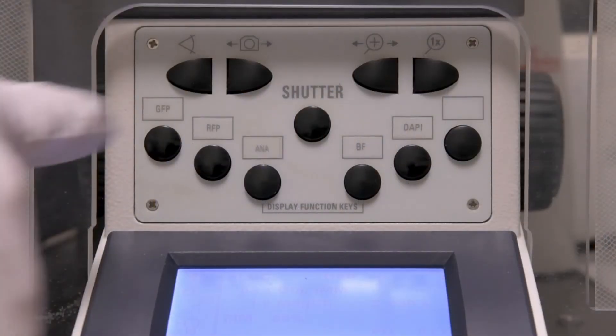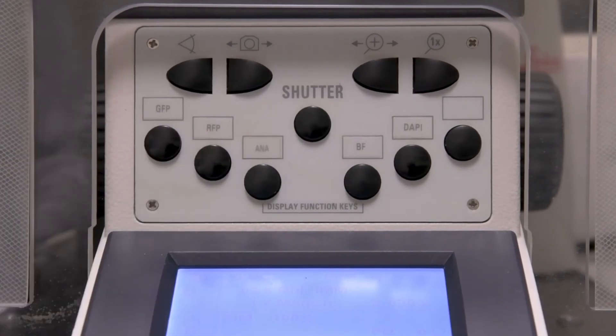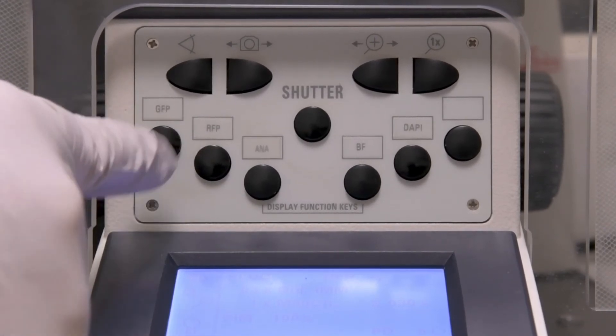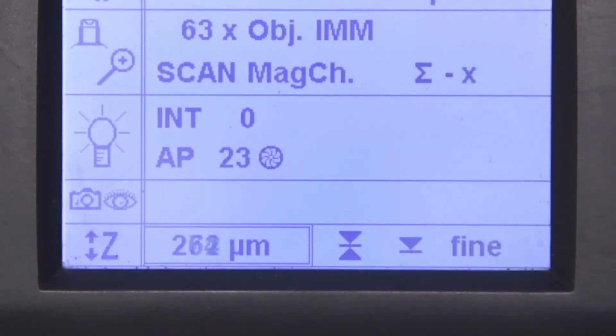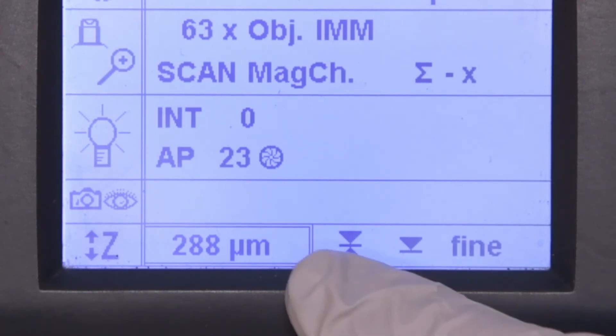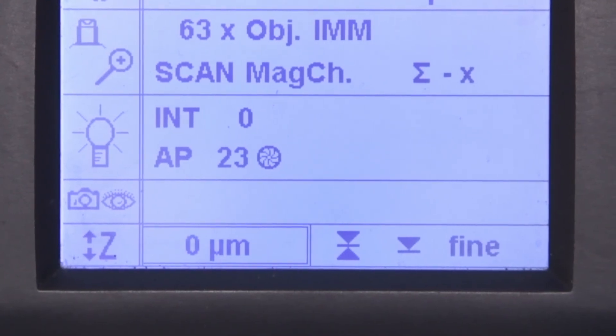After you have focused on the nuclei, you can push the other filter cube teeth to look in the other channels. Once you have something in focus, take a look at the Z position on the front panel. If it is more than 100 microns away in either plus or minus direction, something is wrong. Usually the slide isn't set in completely flat. You will have to lower the lens, check the slide, and then find your image again.